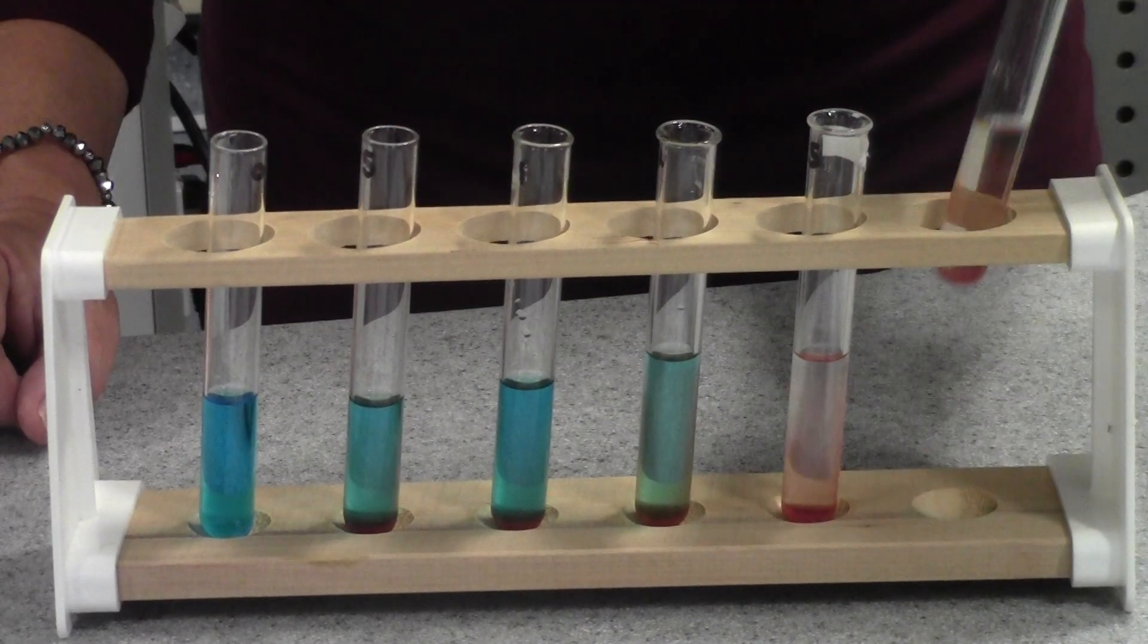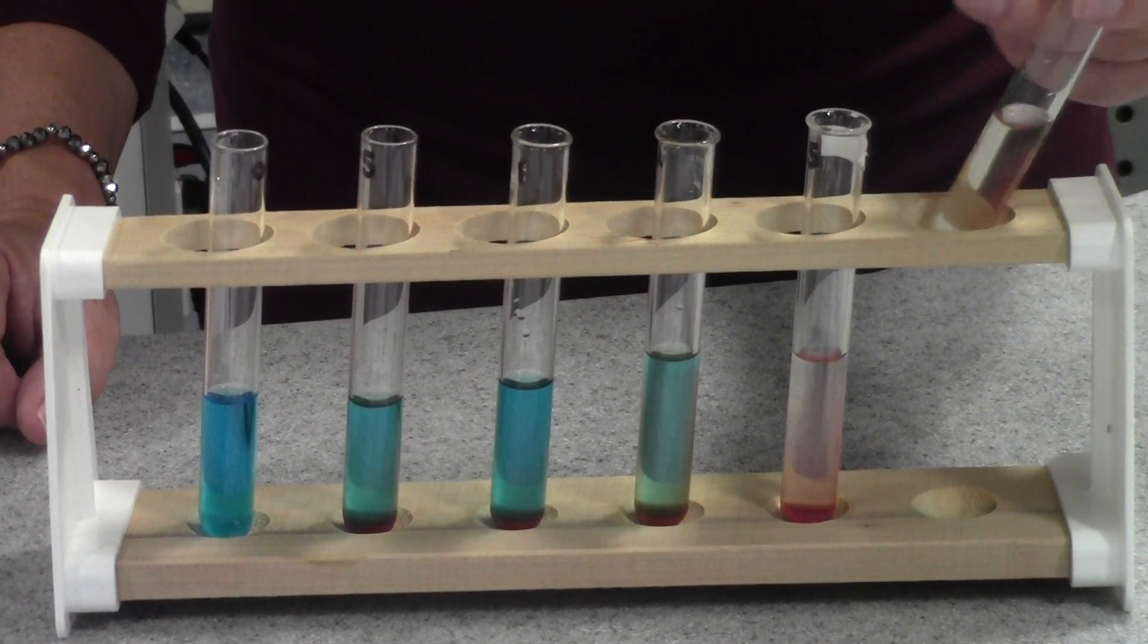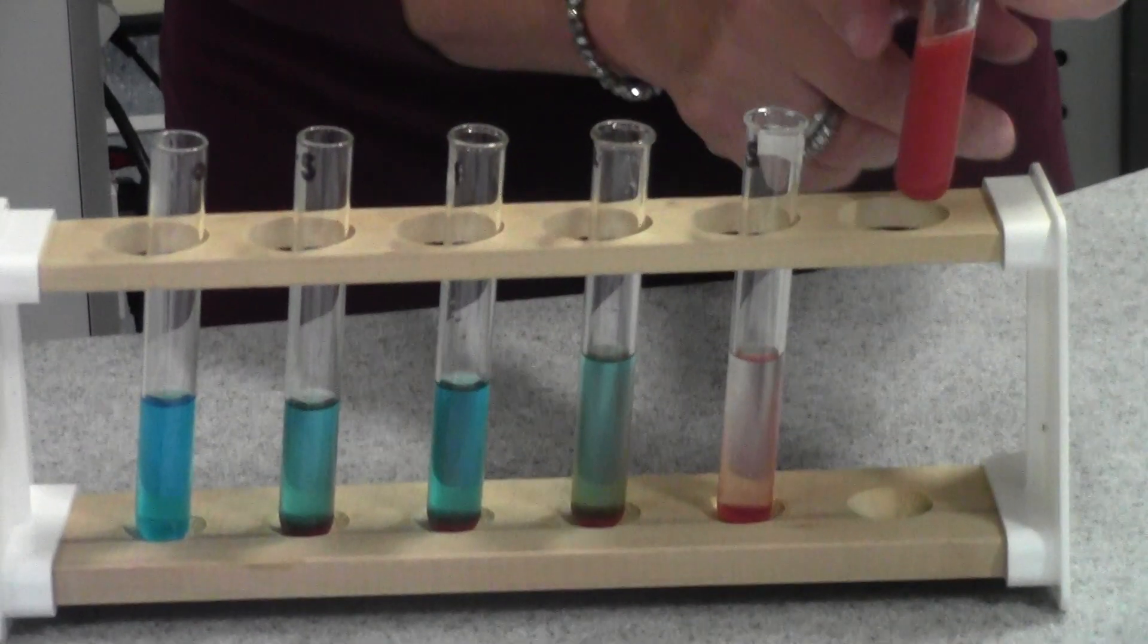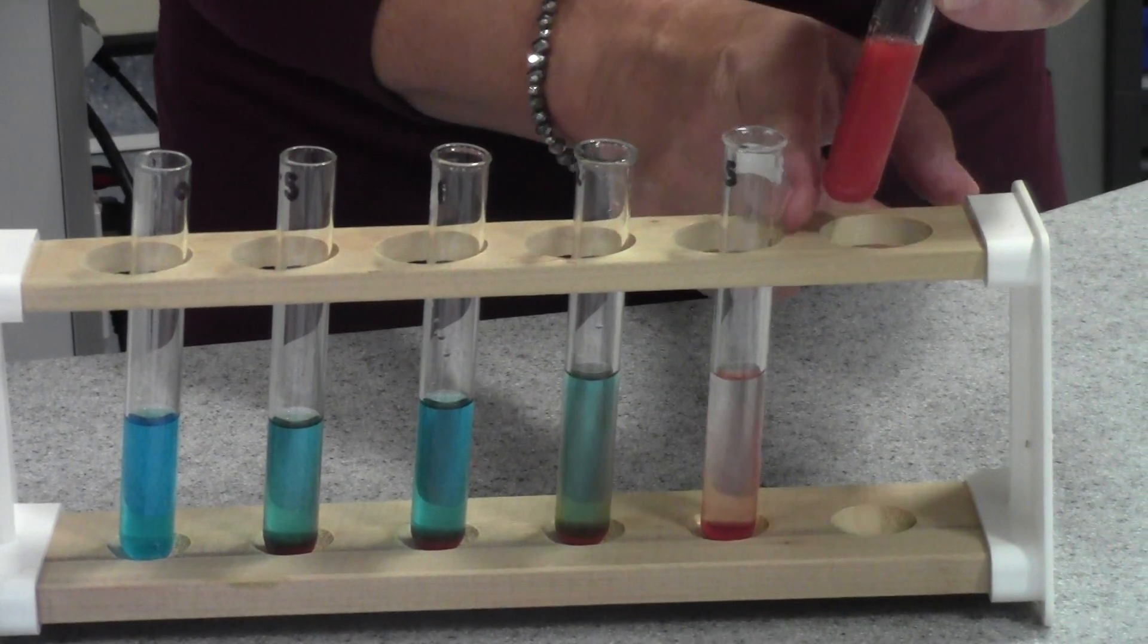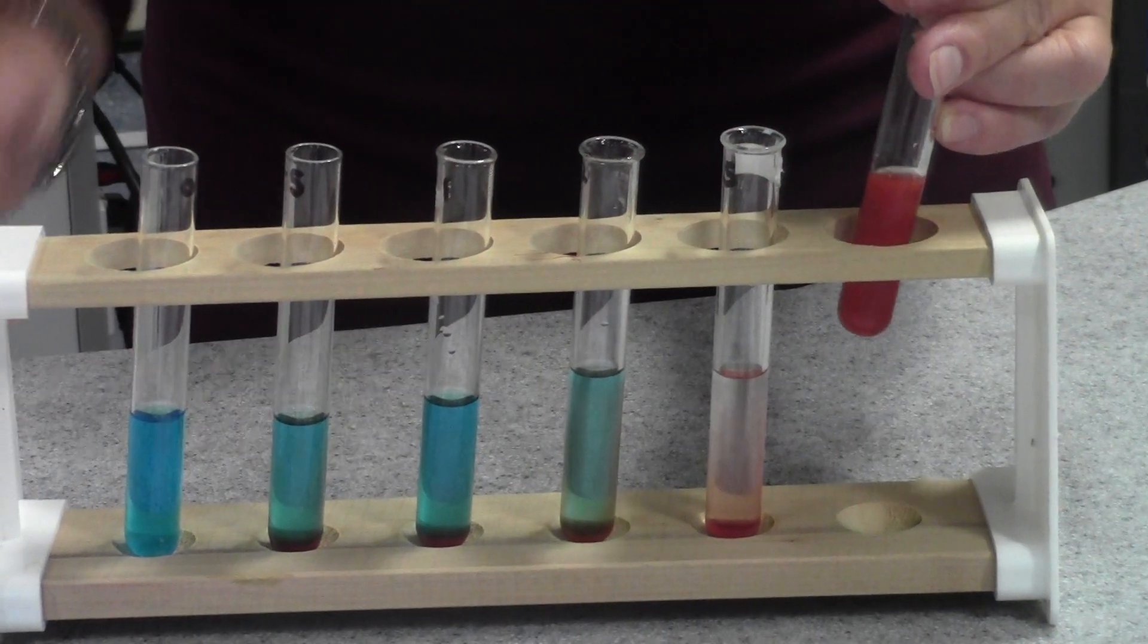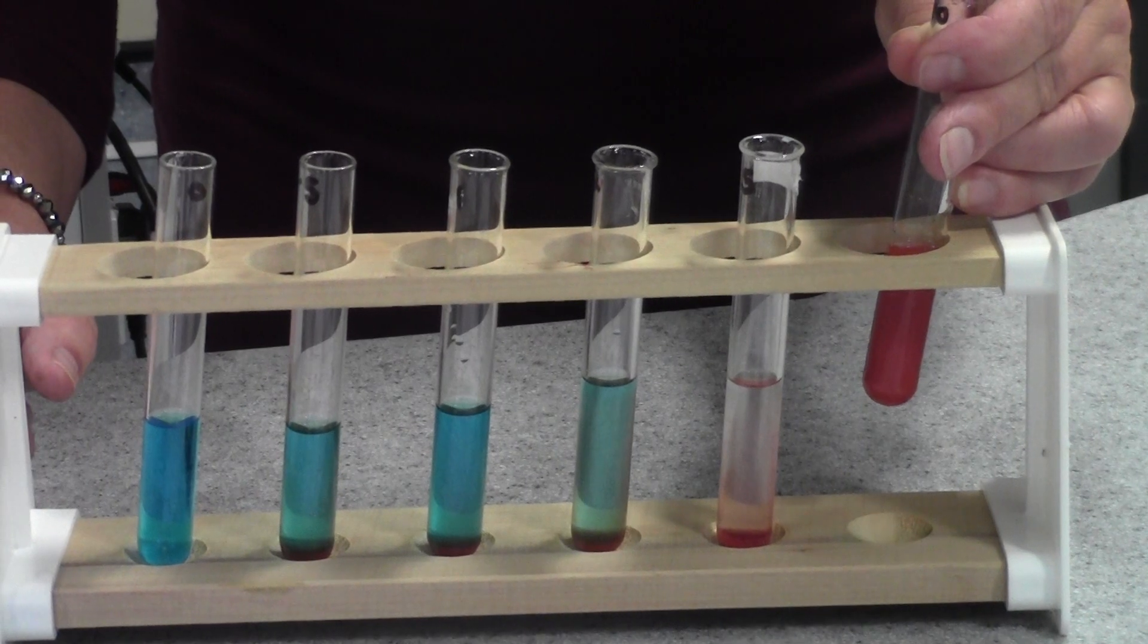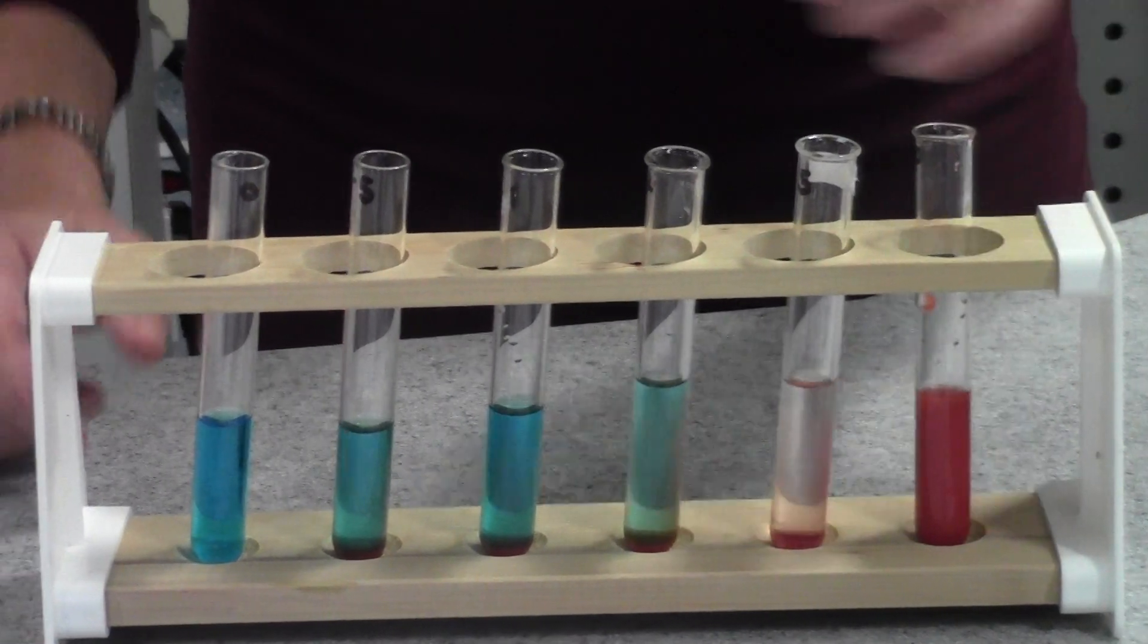Whereas at the other end of the scale, this was the 10% glucose solution. I'm just going to give it a little shake because it's settled out, and you can see in there we've got quite a lot of brick red precipitate because a lot of the Benedict's reagent has reacted with the reducing sugar that was in that sample.